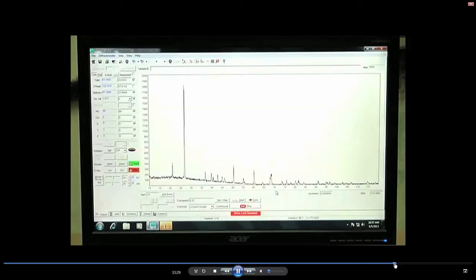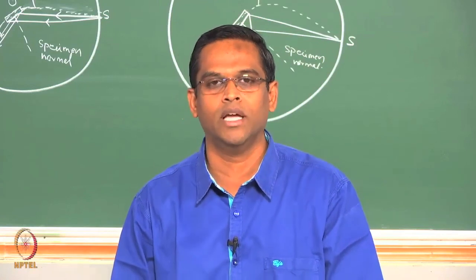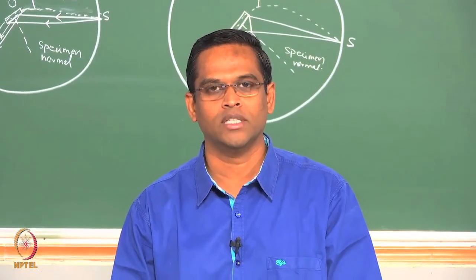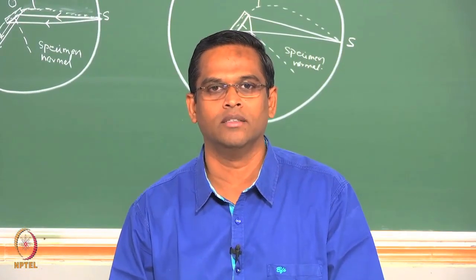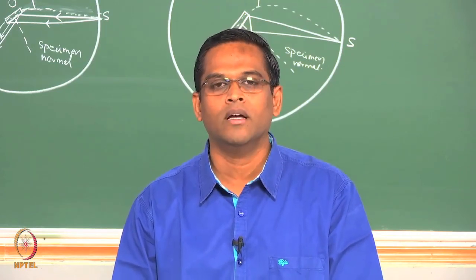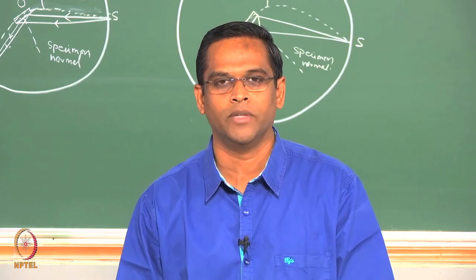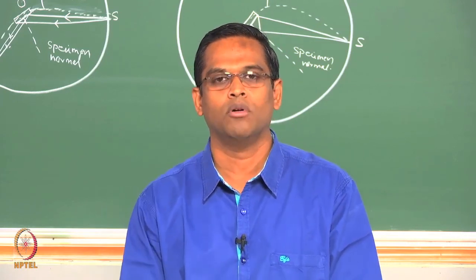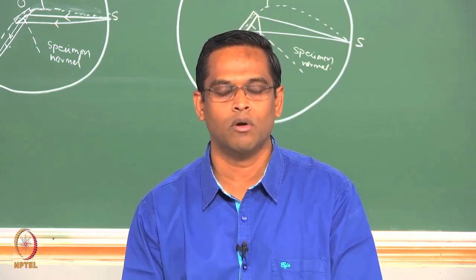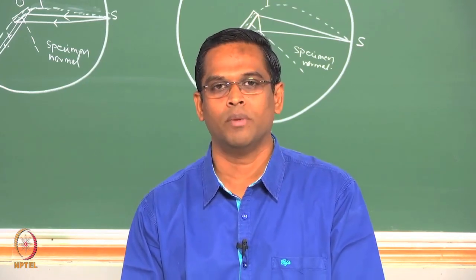So with that, I think you have some basic idea, if not a very detailed idea, of what the X-ray diffractometer looks like, how the source and the specimens are kept, how the detectors are kept, and what the basic data is you get out of this equipment. I hope these equipments and these small demonstrations gave you some basic insight into an X-ray diffraction laboratory. If you are not able to access this laboratory, at least you now know what this equipment looks like and what the basic operations behind it are.